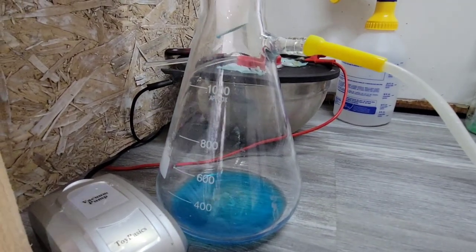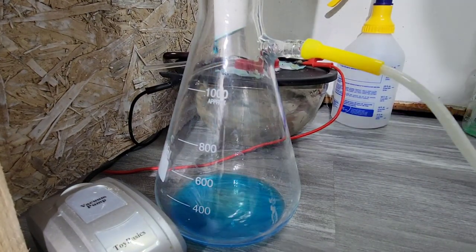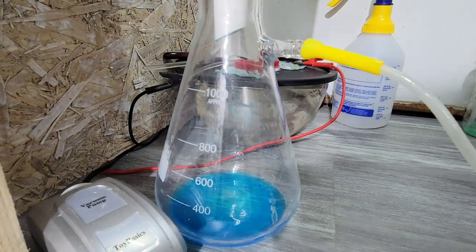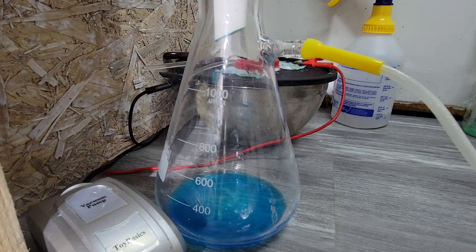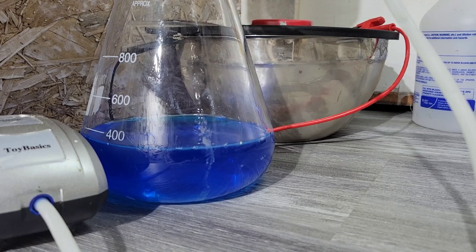See how crystal clear that is now. That's what we're looking for. Well, you don't have to watch this filter. It's going to take some time. When it's done filtering, I will go ahead and take you to the cementation process. Well, we're still filtering, but we can see how clear that solution is now.